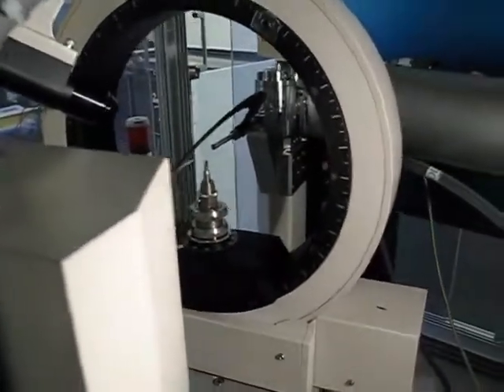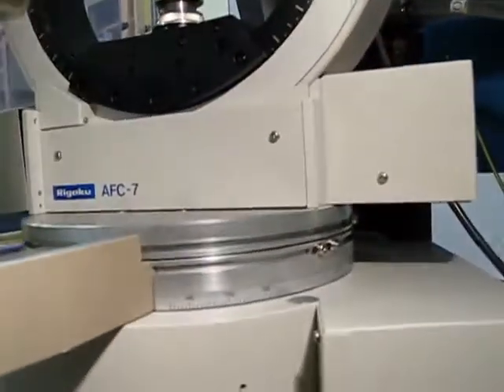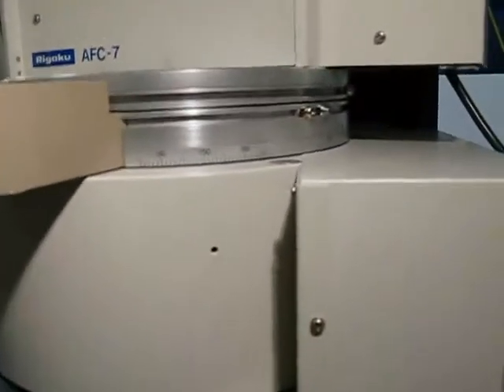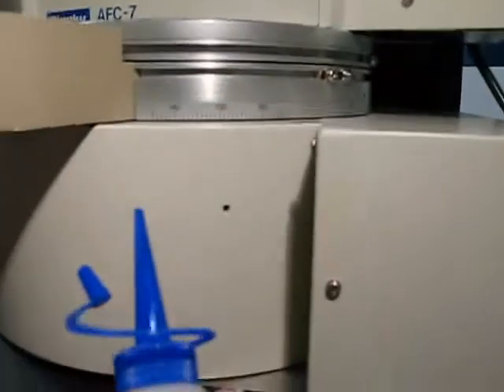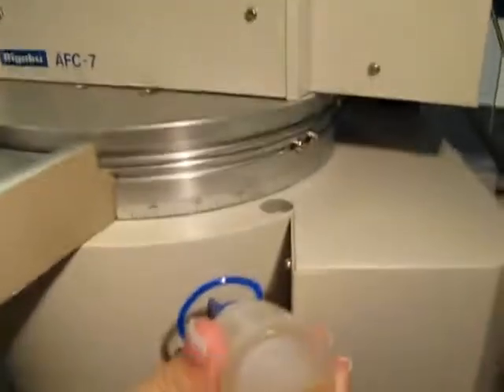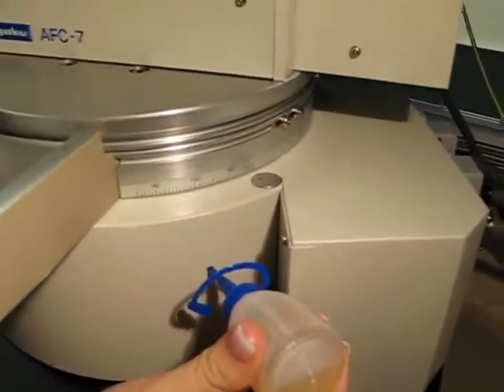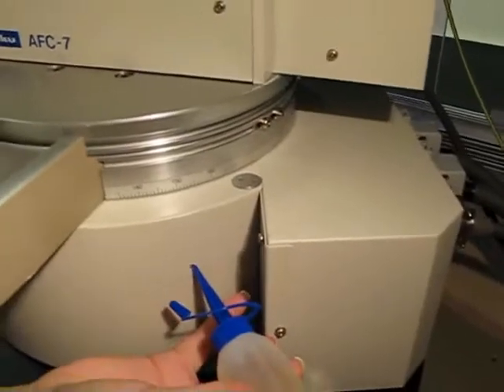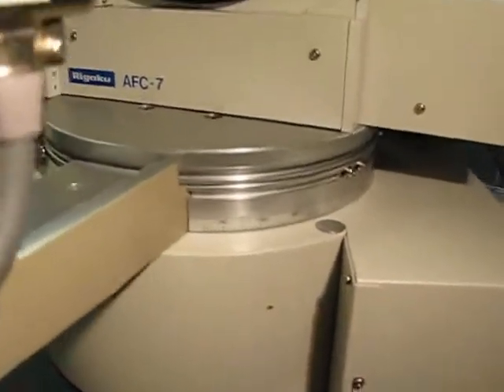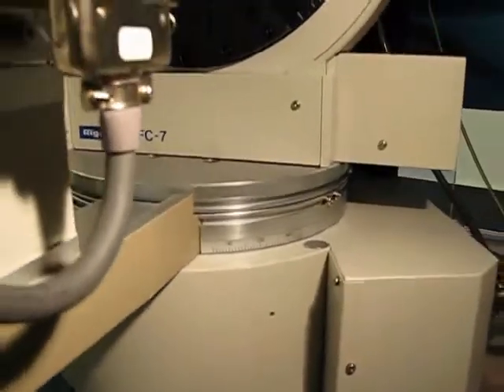Port B is right there, located further down on the diffractometer and kind of in a precarious position to get to. So we're going to do the same thing — we're going to put one milliliter. You stick it in and then you lube it. And there you go — there you have it. Quite simple.